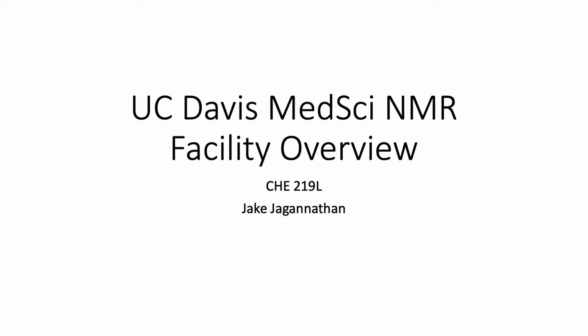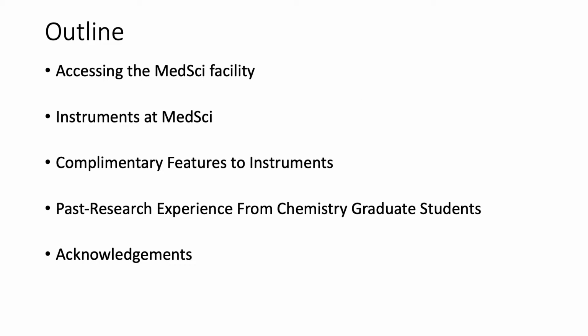This is the UC Davis MedSci NMR facility overview. In this video, we'll be going over the following things: accessing the MedSci facility, the NMR instruments specifically at the MedSci facility, some complementary features to the instruments, as well as some past research experience from chemistry graduate students, and lastly, acknowledgments.